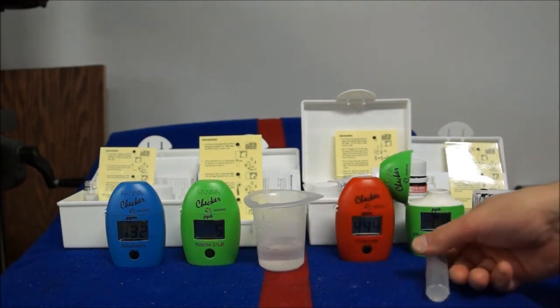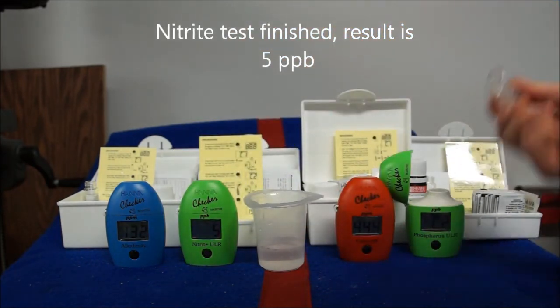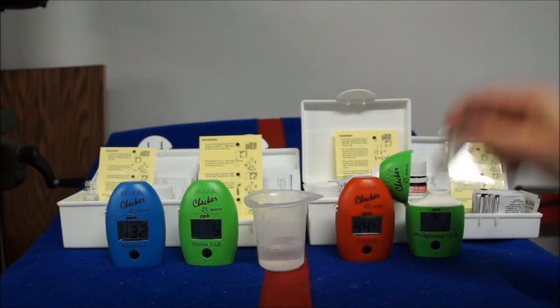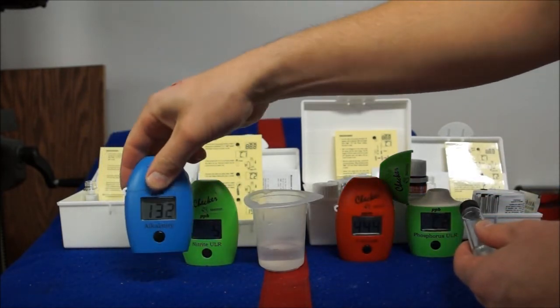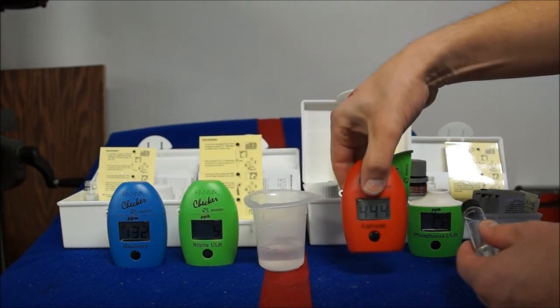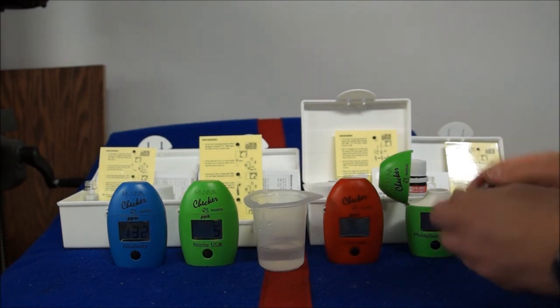Since we do this once a week, the nitrite one here is done — it's five parts per billion. If you put that in parts per million like a lot of tests, that'd be 0.005 ppm. That's pretty low nitrite — a good value for us, pretty consistent for this particular 55 gallon. So we have 132 on the alkalinity, which is 7.39 dKH; five parts per billion on the nitrites; and calcium was 444. And we're going to get the phosphorus value too from the phosphorus marine ultra low Hanna Checker — again in parts per billion.